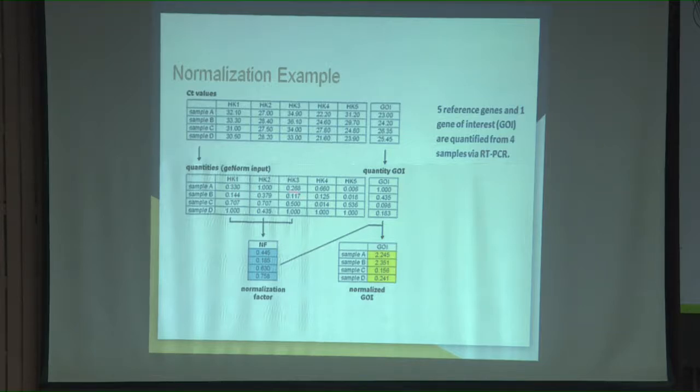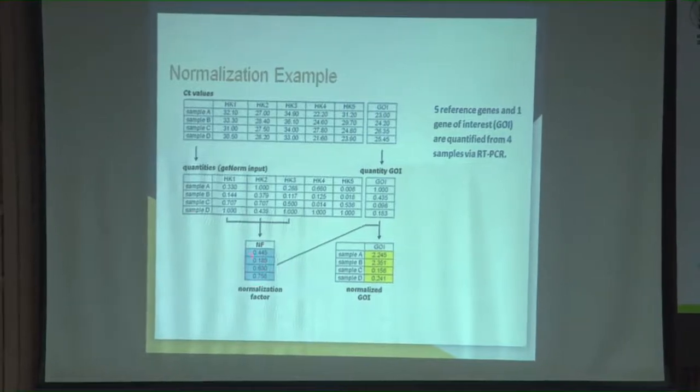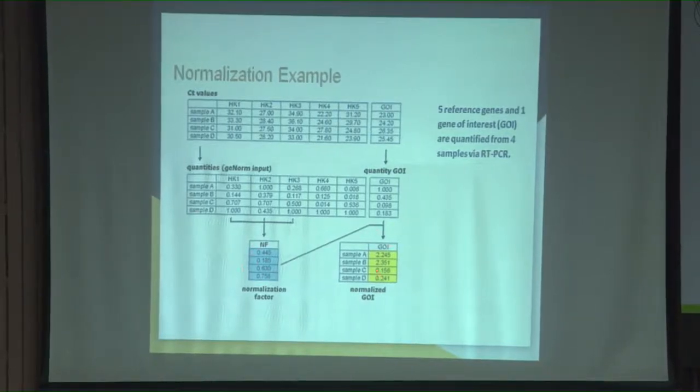Okay? The geometric mean of these 3, and I will call it the normalization factor. So, it is not of one gene, but it is a normalization factor where I have considered multiple reference genes and taken the mean of that. Why geometric mean? Because we are talking in terms of fold change, not absolute amount. Had it been absolute amount, you could think of the arithmetic mean, is it not? Since it is a fold change matter, we are taking the geometric mean and using it as the normalization factor, and then we do the same thing as you have seen in the previous slides.